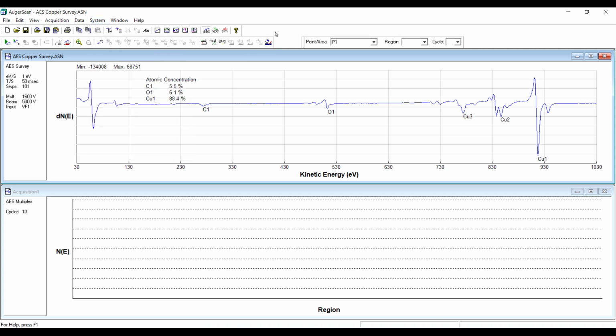Okay, then finally I said we'd talk about the help. The help no longer works because Microsoft stopped supporting their own help format. And this is something that we've used, again, going back into the 90s. So you can't really use the help. It won't work. Starting with Windows 8, it was hard, but by Windows 10, it was not working at all.